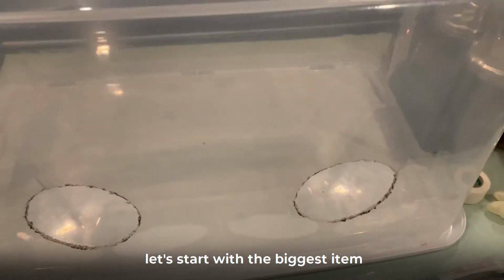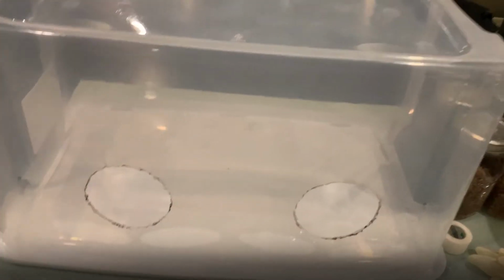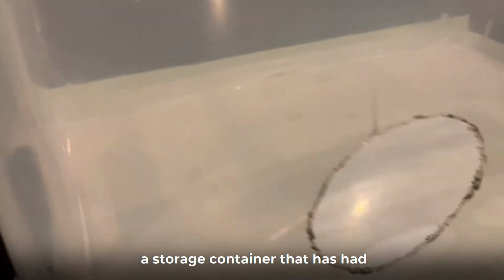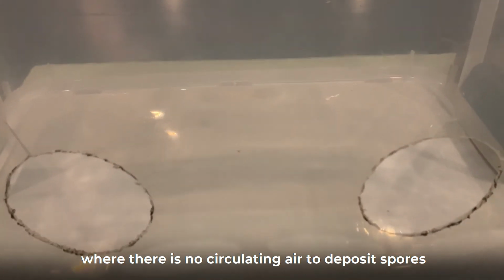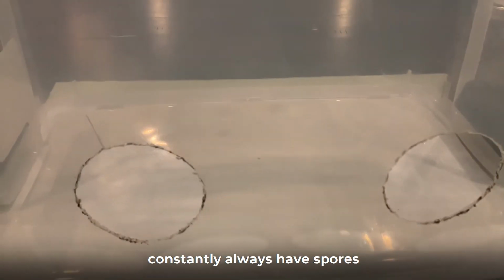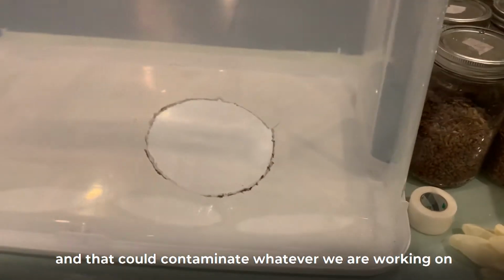Let's start with the biggest item. This right here is a still air box, which is a homemade item. It is a storage container that has had 2 holes cut in it for me to insert my arms. Its purpose is to create an area where there's no circulating air to deposit spores on my work area, because you always have spores circulating in the air pretty much anywhere, in your home, outside, anywhere. And that could contaminate whatever we're working on.